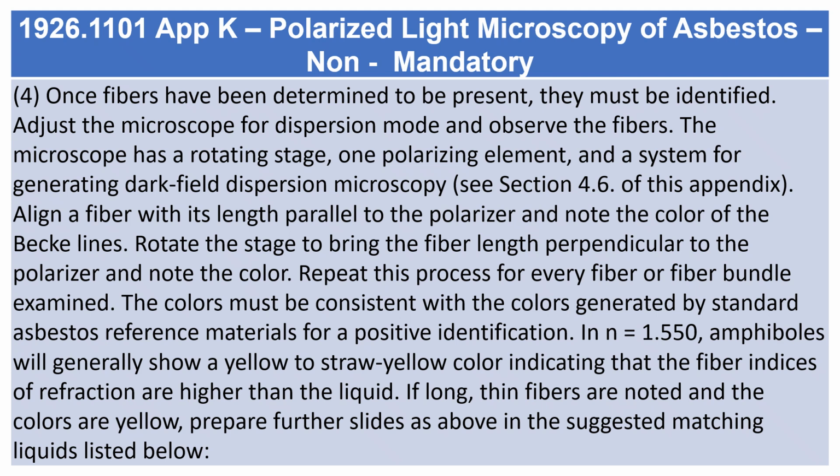In n equals 1.550, amphiboles will generally show a yellow to straw yellow color, indicating that the fiber indices of refraction are higher than the liquid. If long, thin fibers are noted and the colors are yellow, prepare further slides as above and the suggested matching liquids listed below.